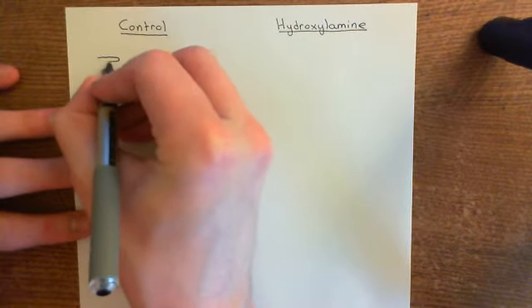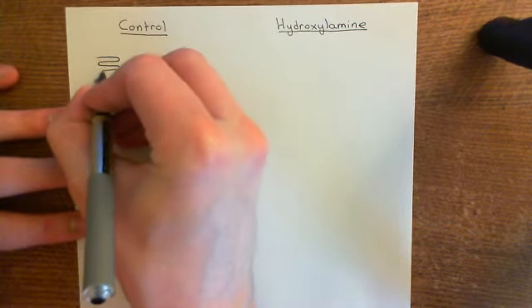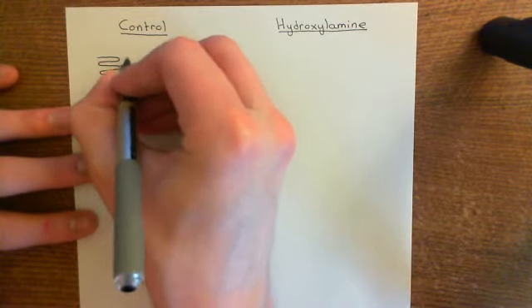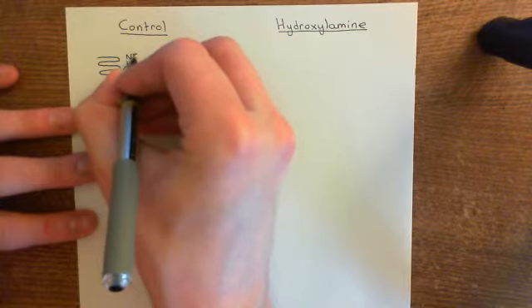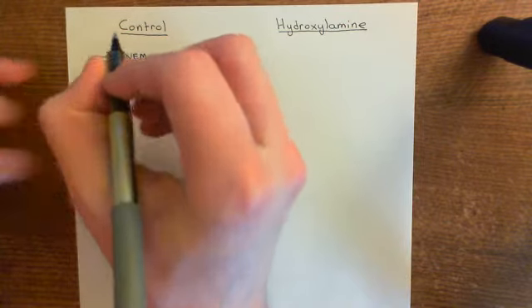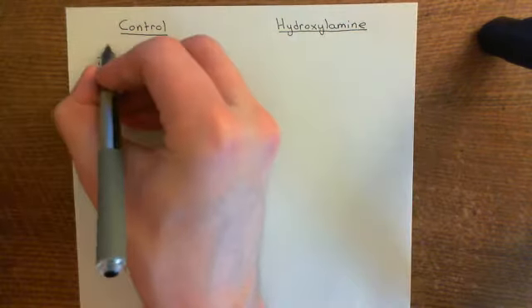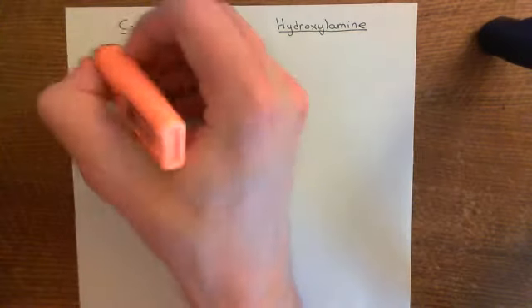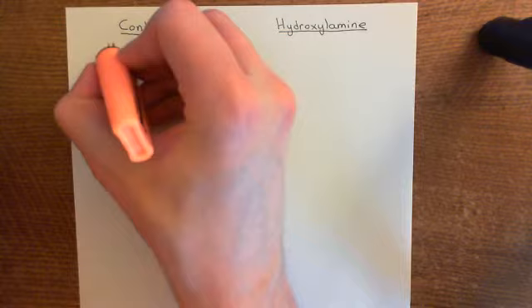In the control, let's start with protein A. Protein A will have all of its initially free cysteines bound to N-ethylmaleimide, and it will still have some cysteine residues which have palmitoyl groups stuck onto them. So this is the state of protein A in the control.